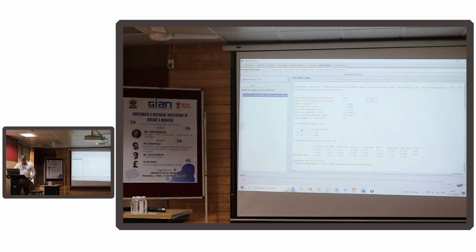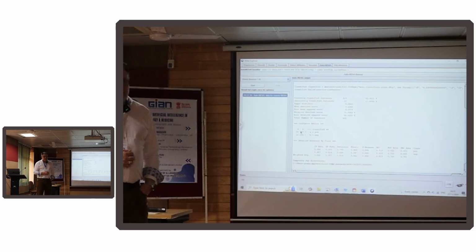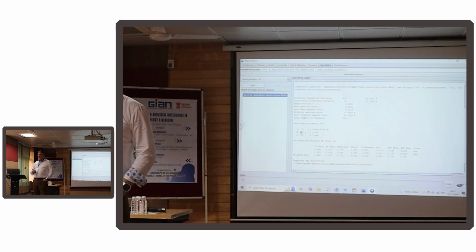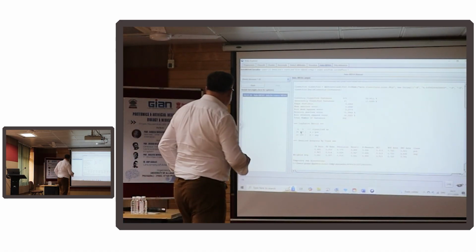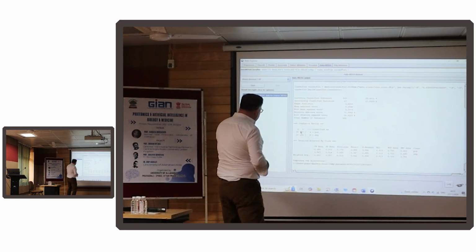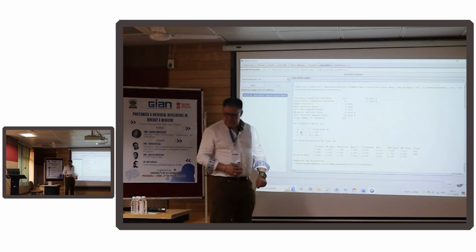It also has a confusion matrix, and let me explain a little bit about confusion matrices. They're used for classifiers, and they tell me how many are right and how many are wrong, but it's a bit more than that. So we know A is positive, B is negative.